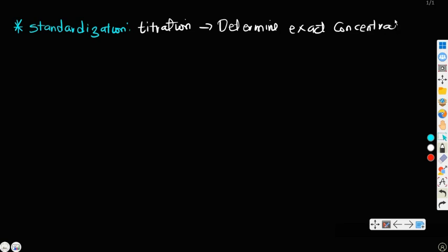All right. Now, what are some of the units of concentration? From what we know, concentration can be in gram per mL. It can even be in gram per deciliter. It can be in mole per dm cubed, etc. Are you getting it now? So the process of trying to determine the exact, please emphasize exact, concentration of anything is what we call what? Standardization. Is that okay?